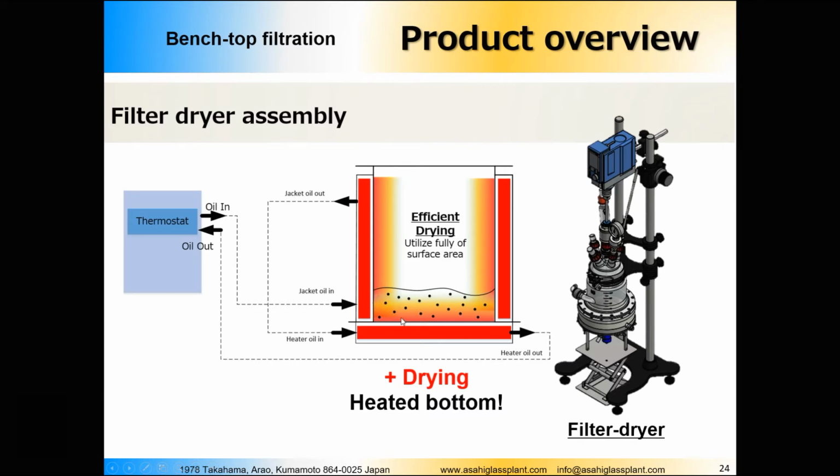But when we're talking about the drying itself, there is no more solvent in here anymore. So we have only the sediment, and the amount of sediment can be relatively low, maybe like this, like 1 centimeter. And of course, in this case, the surface area which heats the sediment would be very small. In order to increase the heating area, we need something that would heat our sediment from the bottom, and that's the heated bottom.